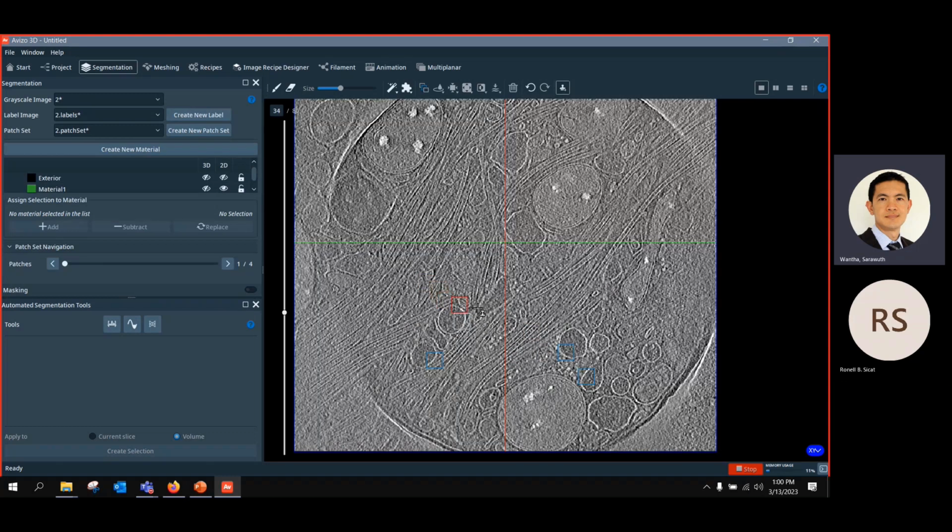You also need to create patches without membrane information to serve as a background or the control. So here, the patch doesn't have a membrane of the vesicle inside. Like this, you can see that I created maybe 4 patches with a membrane here, here, here, and here, and another 4 patches without membrane.